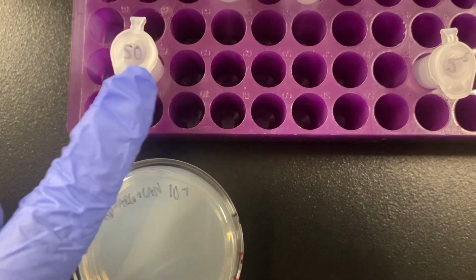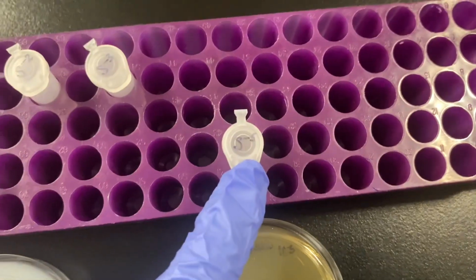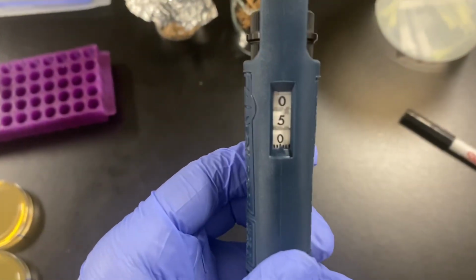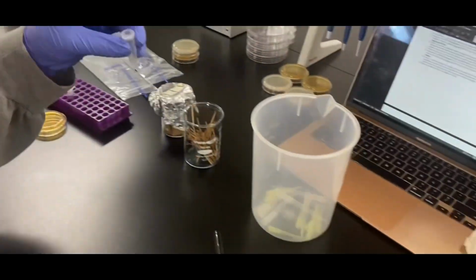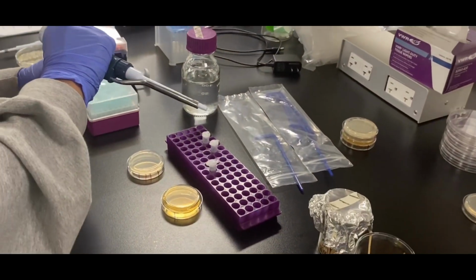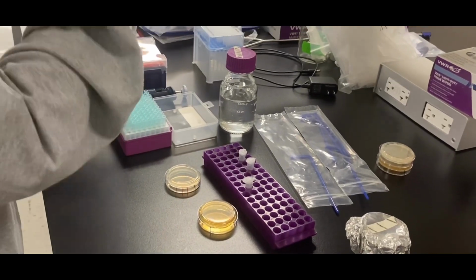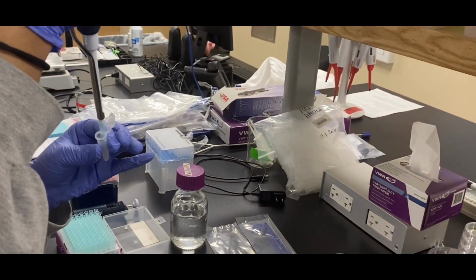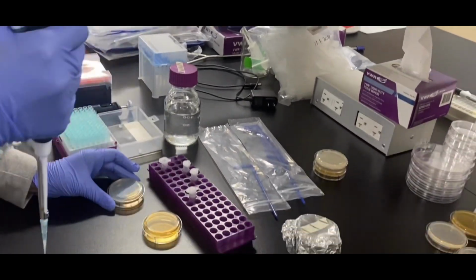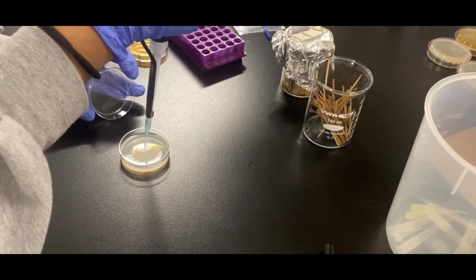Once your dilution is complete, obtain the YPD and SD minus arginine plus canavanine plates that you previously labeled. Adjust the P200 micropipette to 0.50. This will allow you to get 50 microliters of solution. Attach a fresh pipette tip and vortex tube S0 or tube 1 and add 50 microliters of the content in tube 1 onto the SD minus arginine plus canavanine plate.